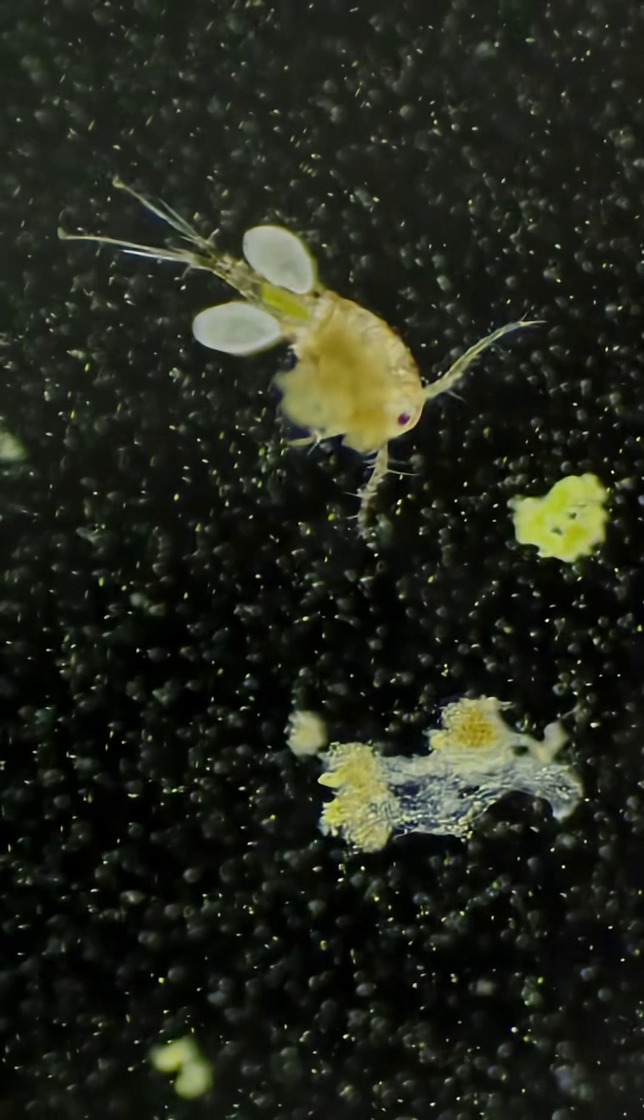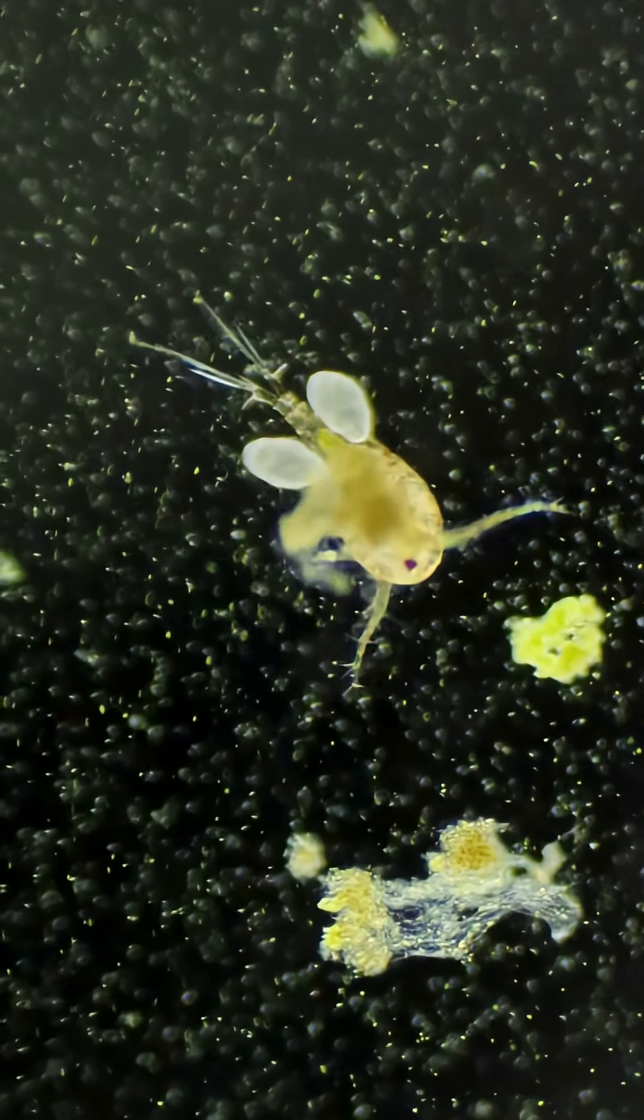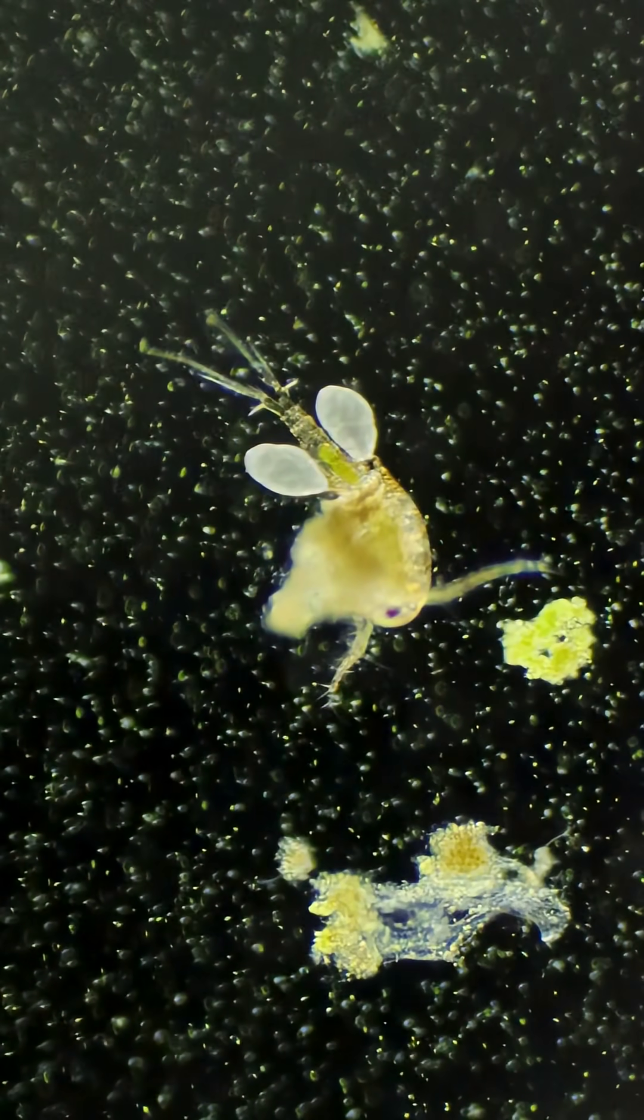Got it eating a bit of algae. I think they're so cool. There are different forms and shapes and colors, but I'm glad I found this one.